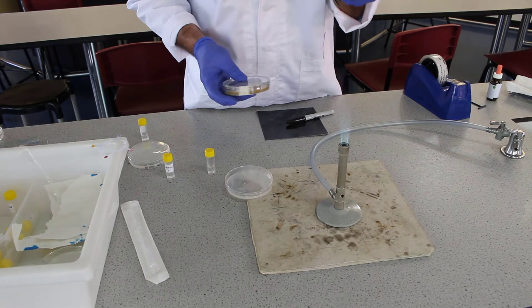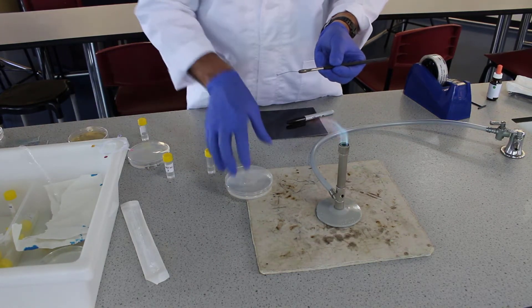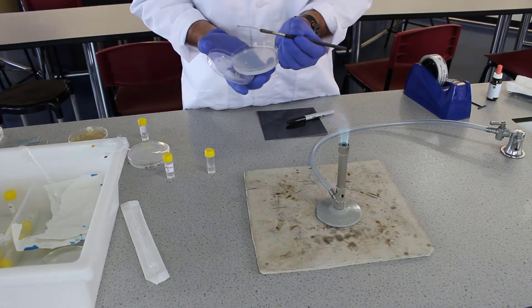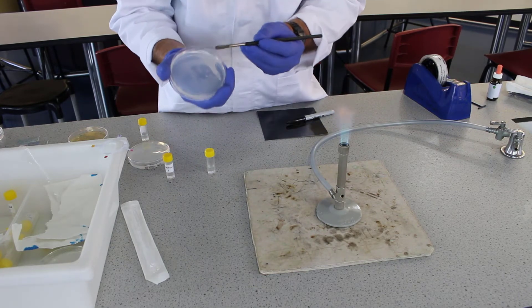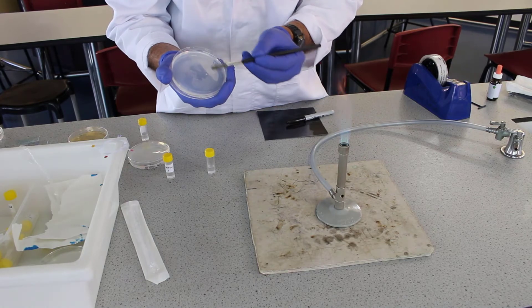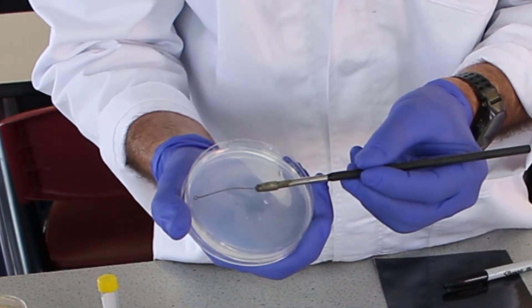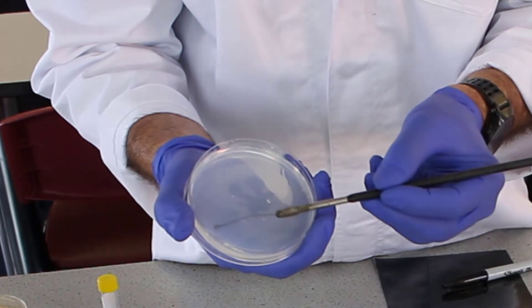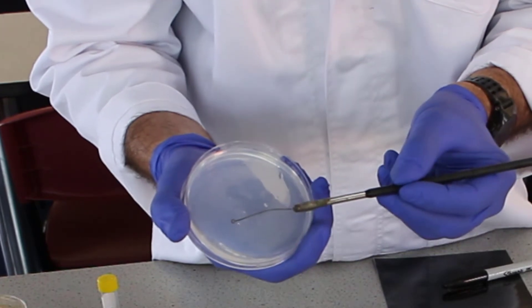We take the colony up in the loop, and now we're going to take our agar plate, holding the lid of the agar plate in our hand as well, and we're going to drag the loop along the agar four times to spread that bacteria along. We have to do it very, very gently to ensure that we don't tear the agar.